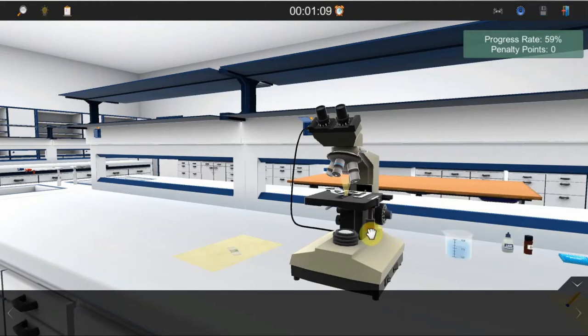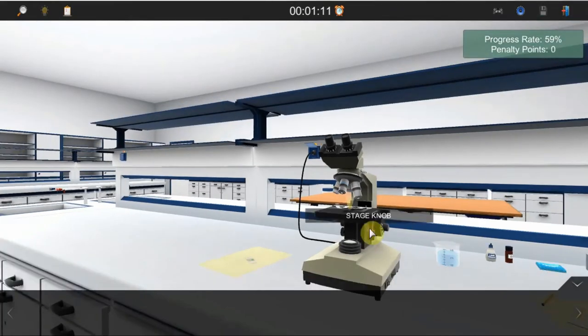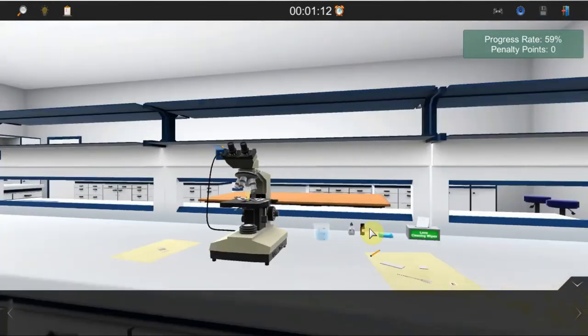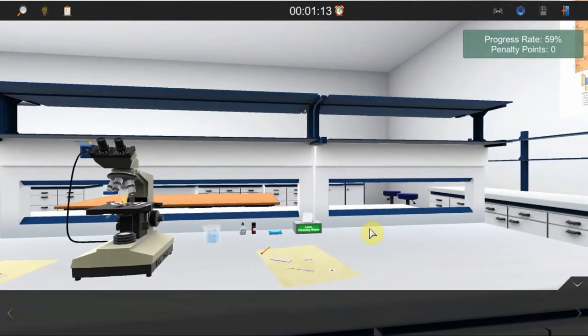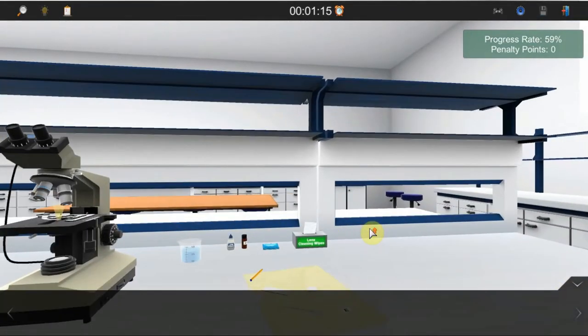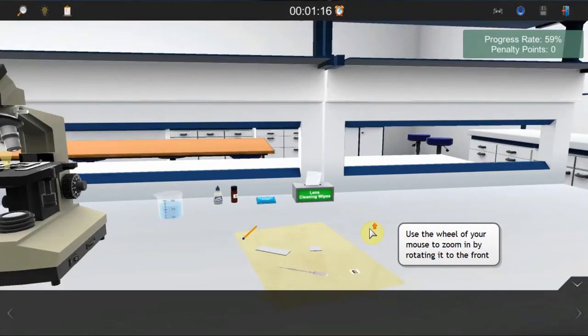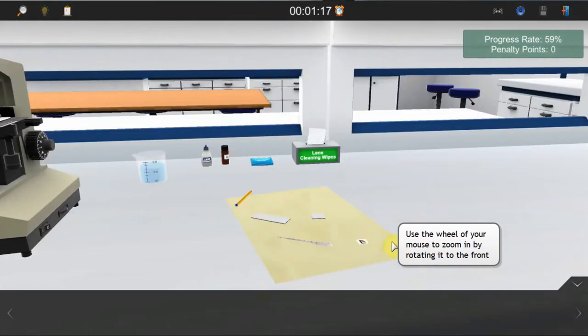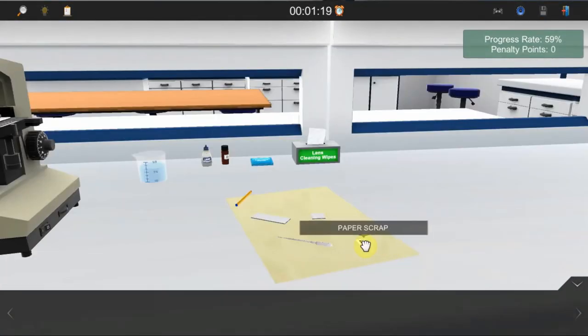It is time now to prepare a test specimen for microscoping. Move slightly to the right of the microscope where the slide, the paper scrap, the pipette, and the slide cover are placed.